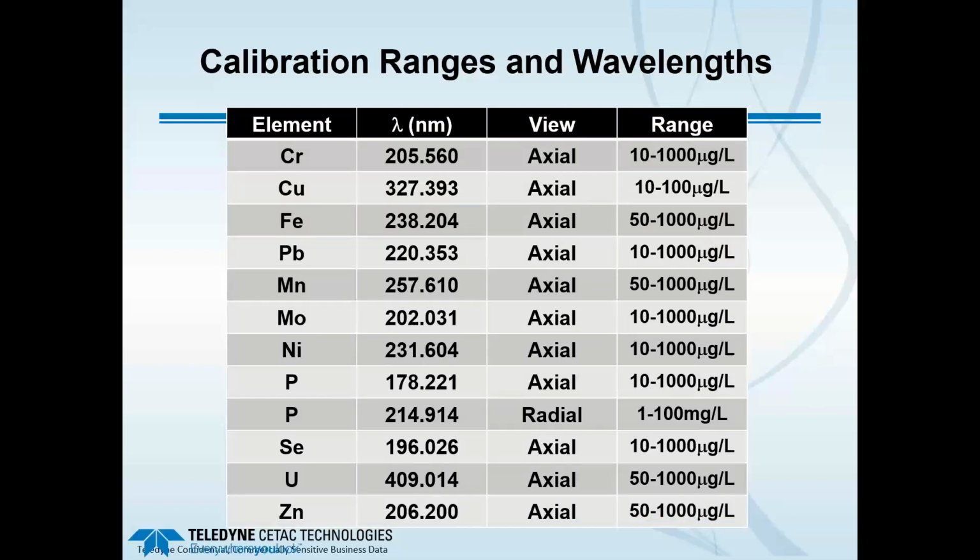And then the additional calibration ranges and wavelengths. Again, the other element that we looked at where we used 2 different wavelengths was phosphorus.